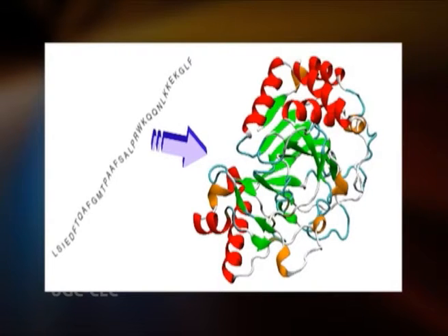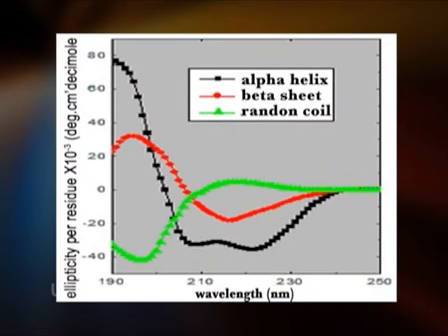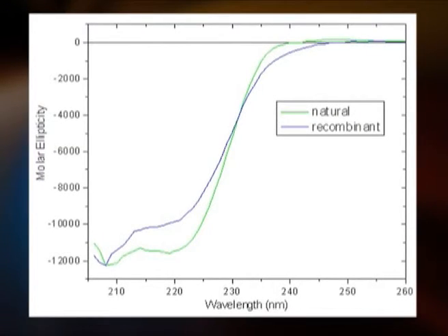Circular dichroism spectroscopy is particularly good for determining whether a protein is folded and if so, characterizing its secondary structure, tertiary structure and structural family to which it belongs. It is also used for comparing the structure of a protein obtained from different sources, for example, species or expression systems, or comparing structures for different mutants of the same protein.